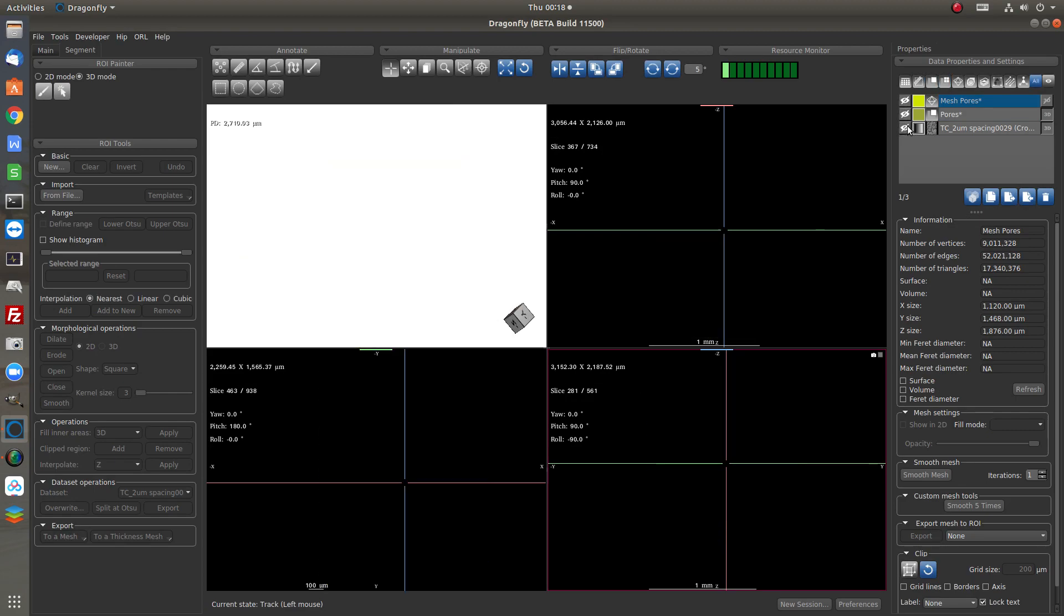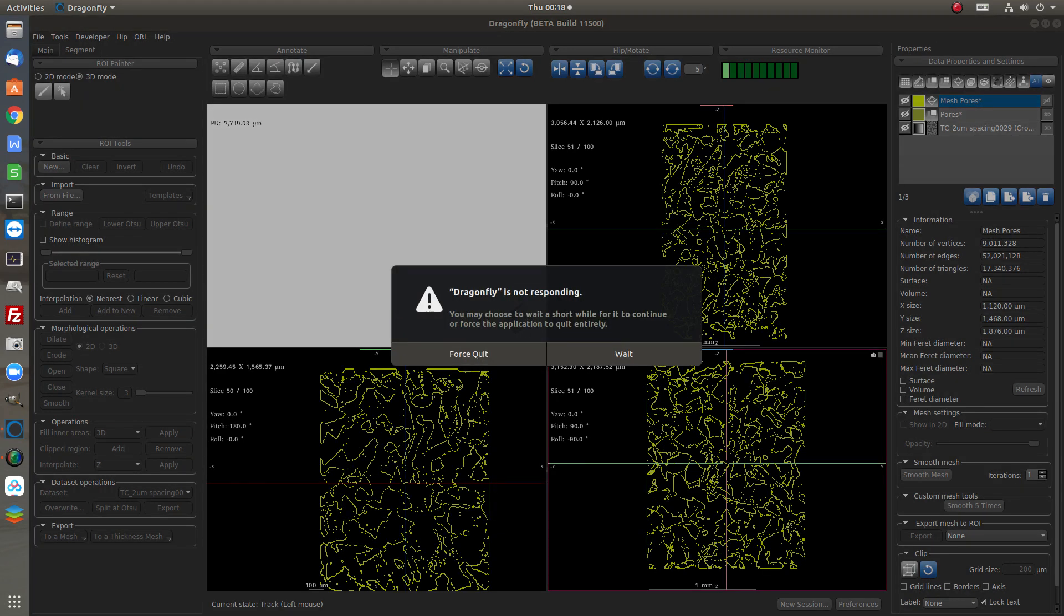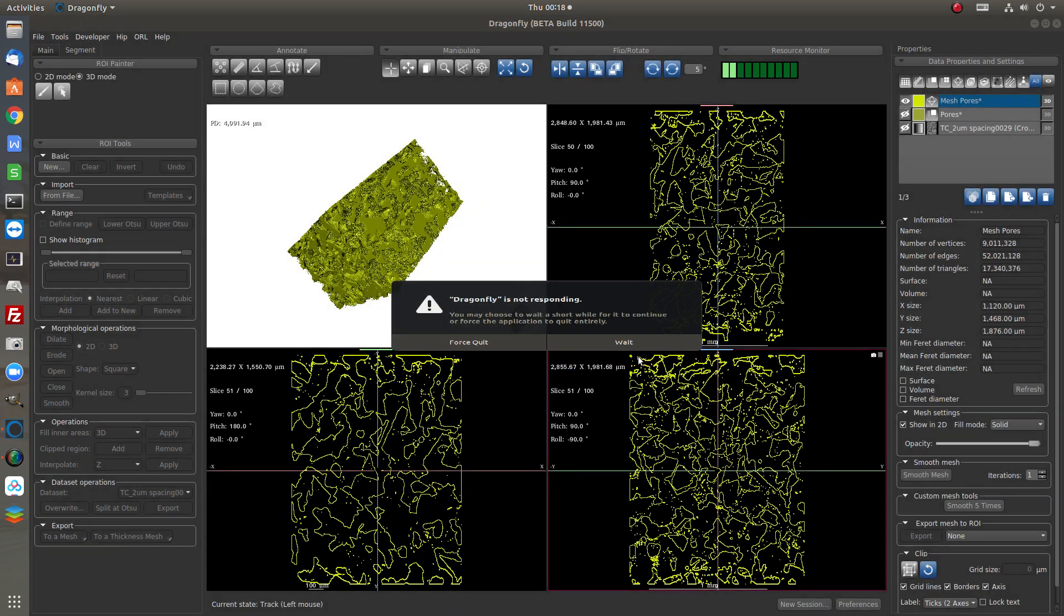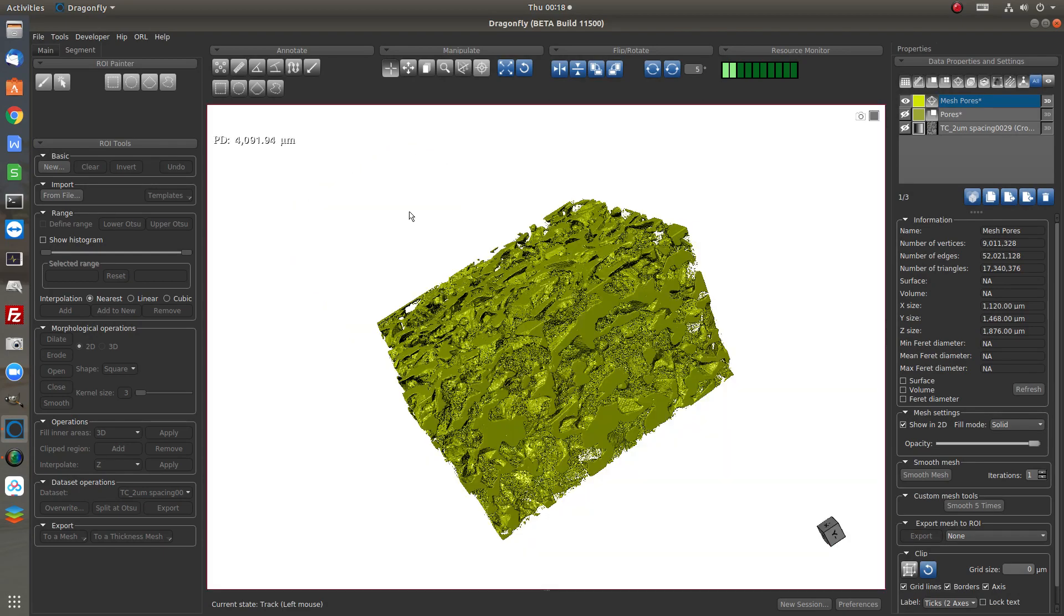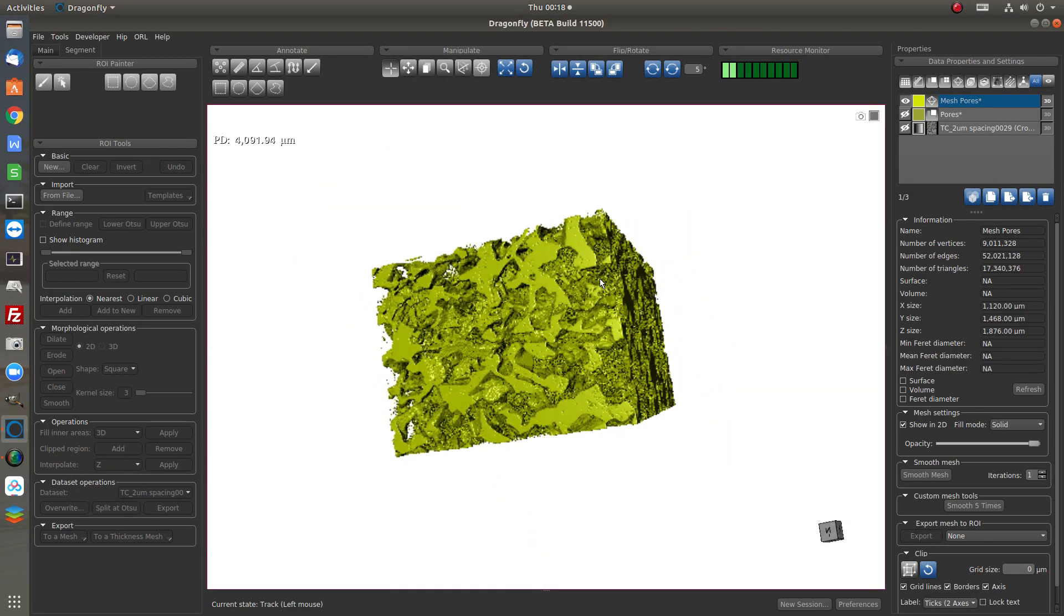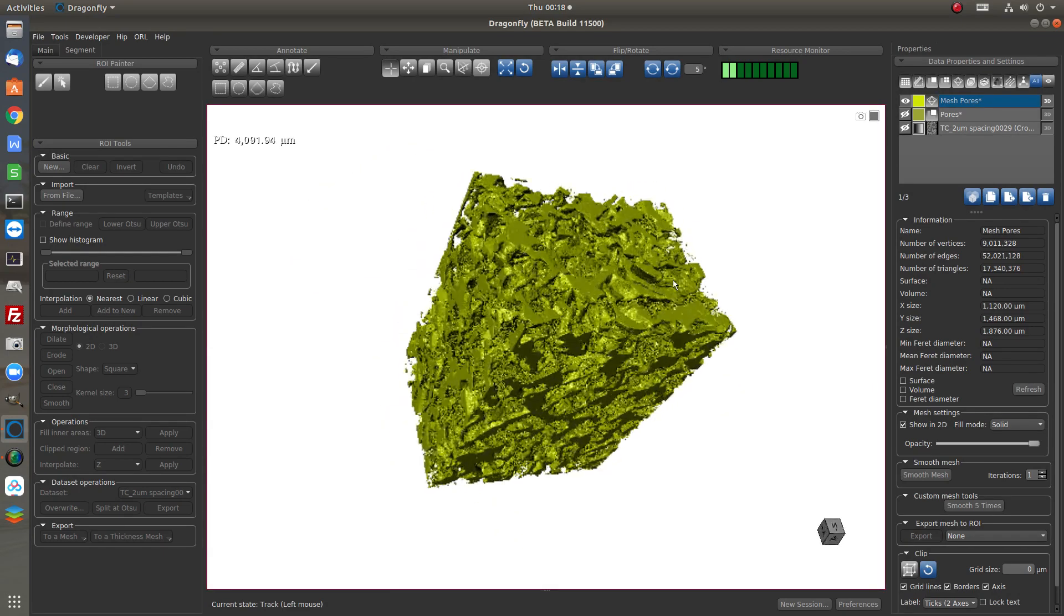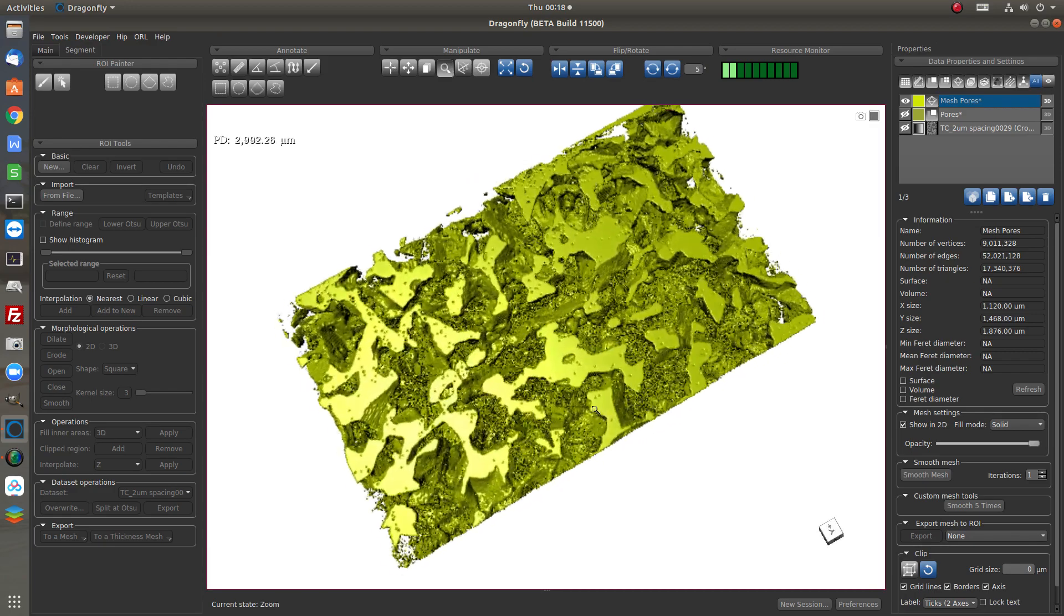Now we have a new object named mesh pores. If we turn on, we have a model which is showing only the pores.